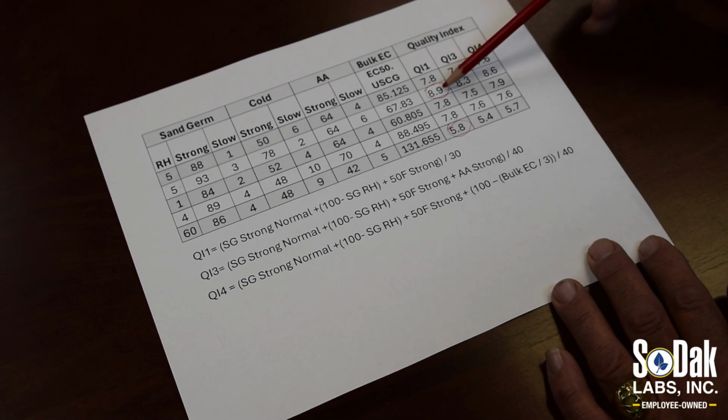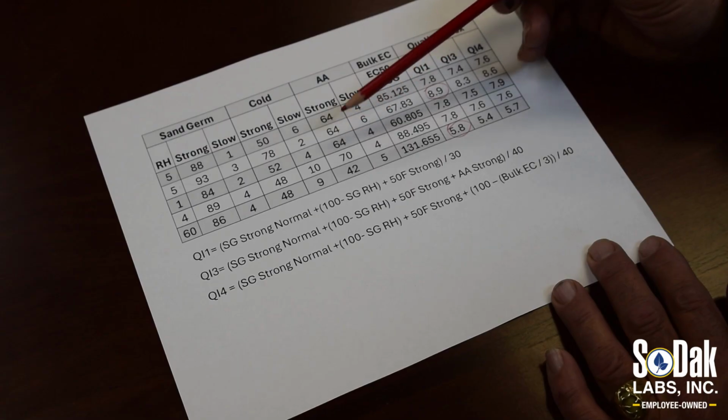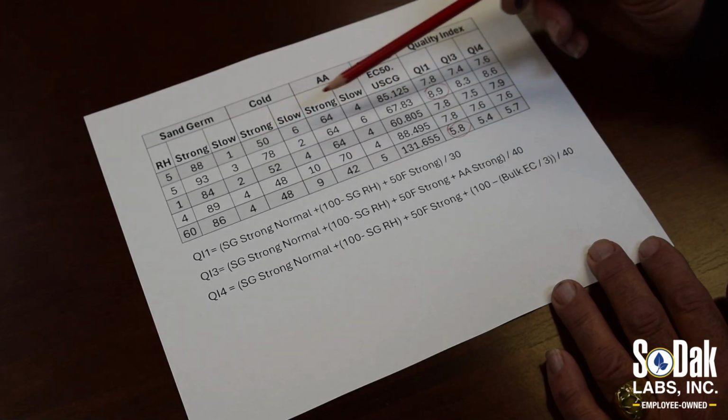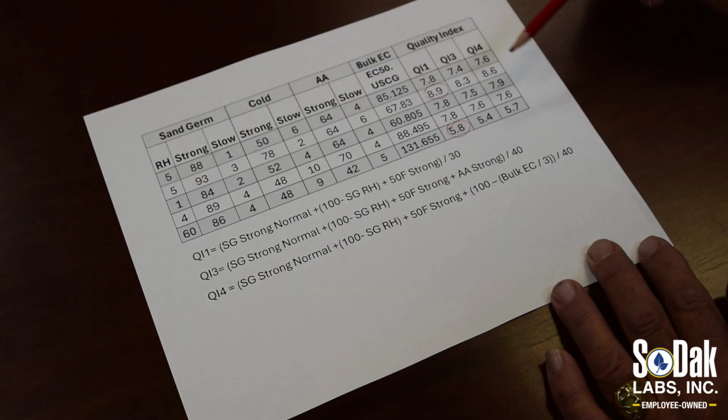It just said that really good one is not quite as strong. That probably had the biggest impact because it had a 64 AA, where its cold was 78, clearly stronger than the others, and the warm was clearly stronger. So it dropped it down.